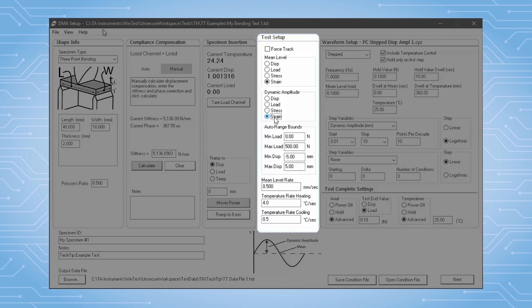We've designed and implemented a new adaptive controller for DMA tests. In addition to tuning-free control, it enables the force track feature to maintain the mean force without requiring users to have any foresight about their specimen stiffness or creep response.